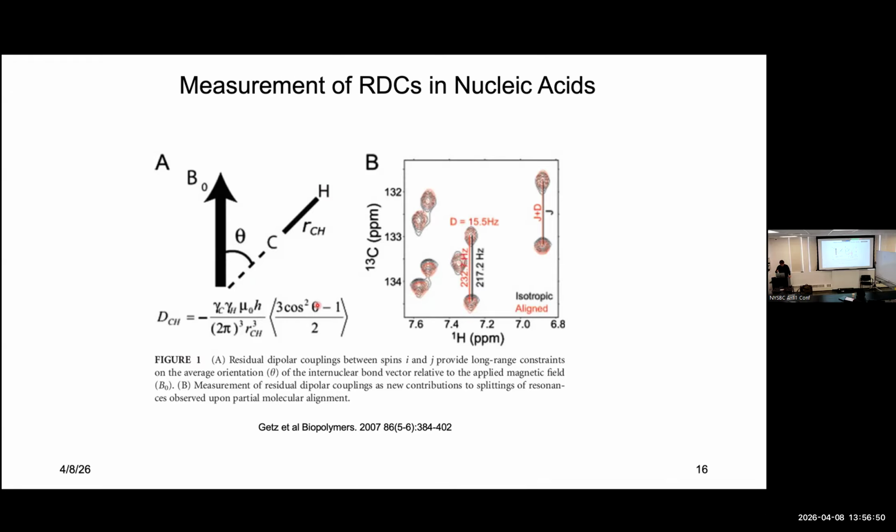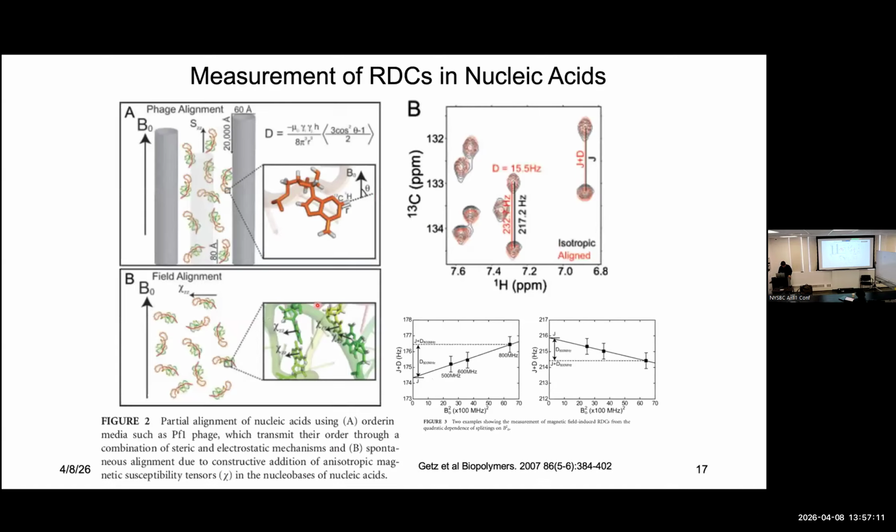We're using Pf1 phage. Unfortunately, as my lab will tell you, this used to be commercially available. You could buy it very readily, but now that company has shut down. So in our lab, nobody can buy phage, and the nucleic acid people are very sad, but we're going to try to make it in our lab this summer. So if anyone out there has any phage, talk to us in August. Hopefully we'll be able to make it.